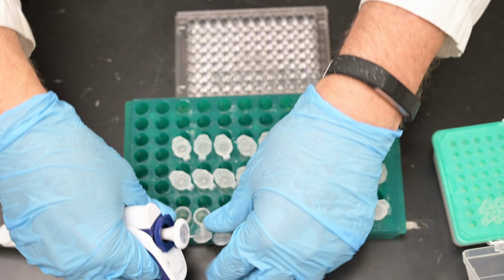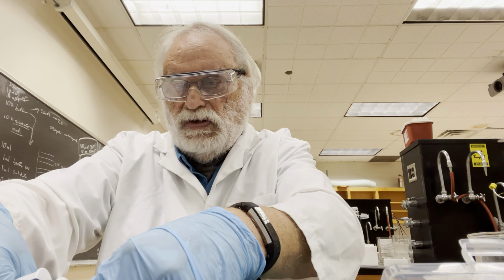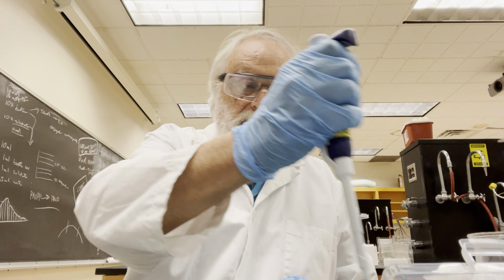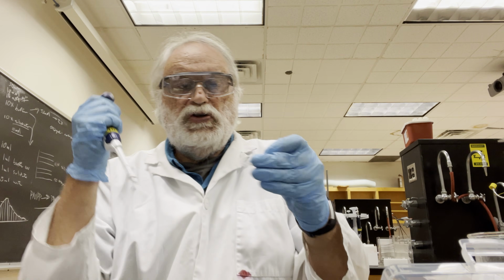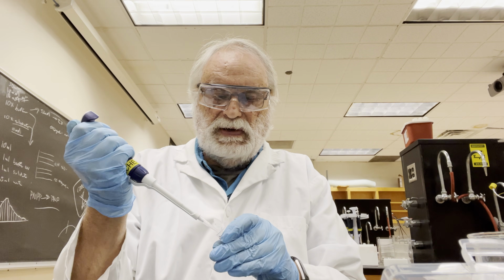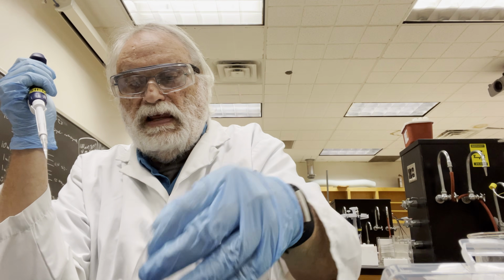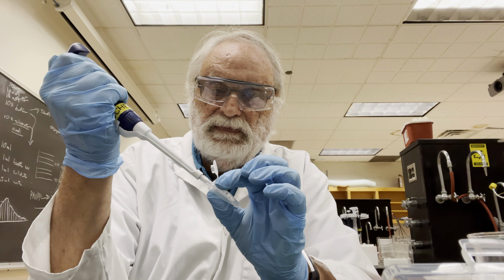What I do to make sure is I'm just going to lift them all up, make sure that I added. So I have 50 microliters of water in each of these tubes. The next step is to add 50 microliters of 2 mg per mil standard to tube number 1. So I'll take 50 microliters out, I'll add it to this tube, and I'll pipette up and down.